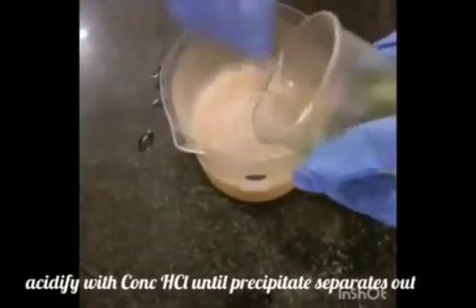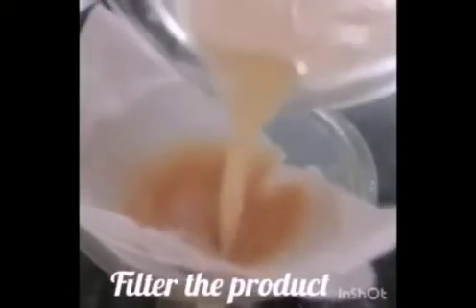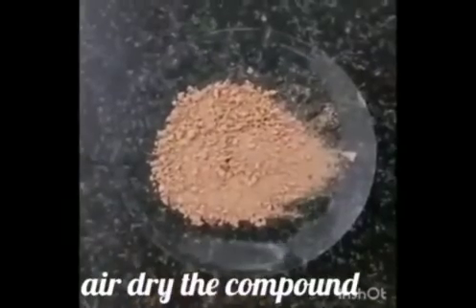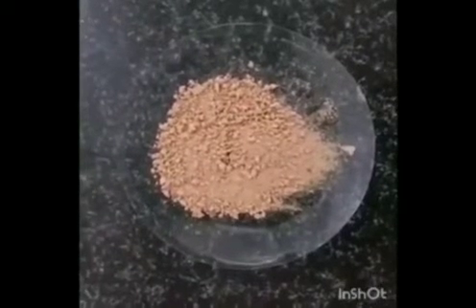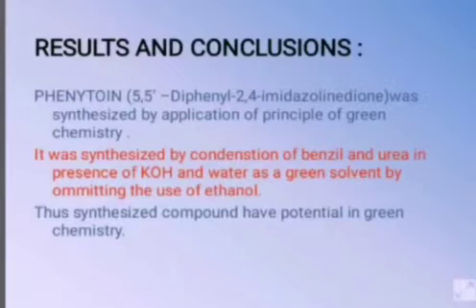Acidify with concentrated HCl until precipitate separates out. Filter the precipitate and air dry the product. Crystalline phenytoin is obtained.